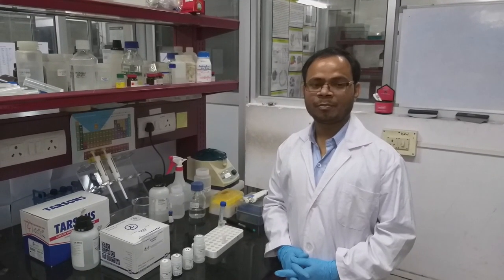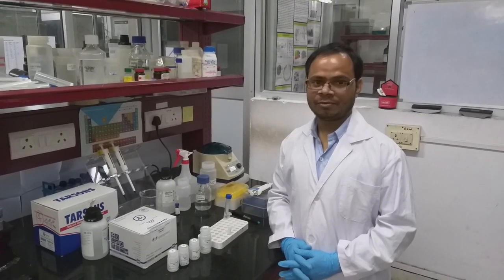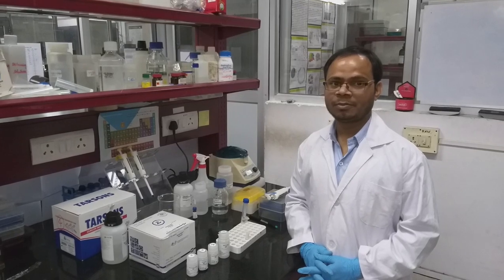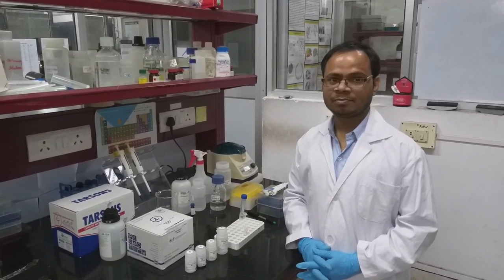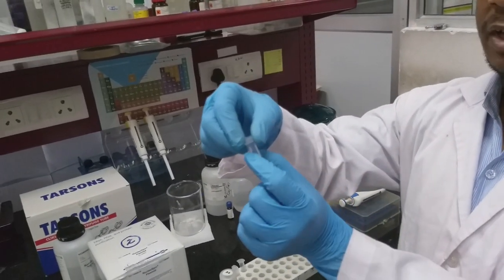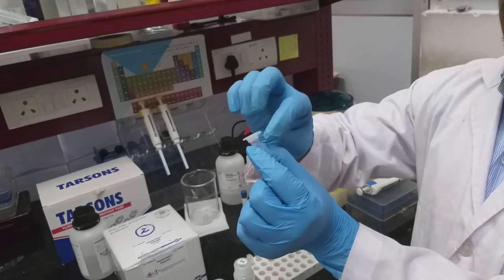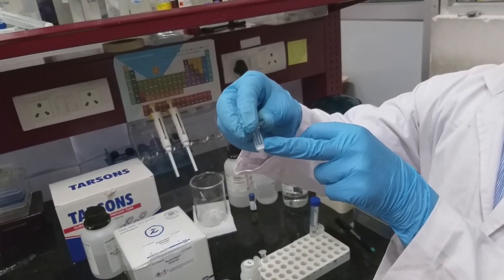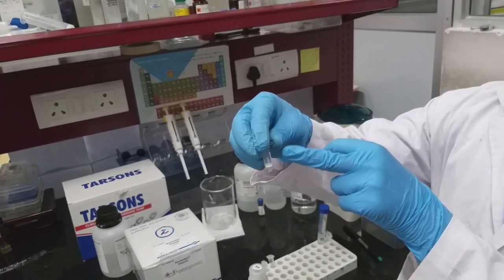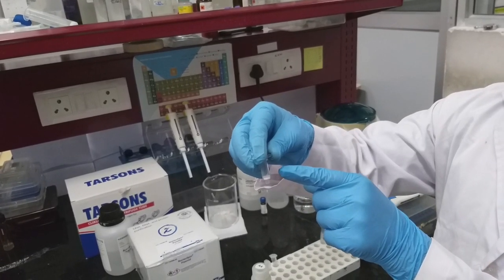To ease the process of the manual alkaline lysis method, there are several kits available from commercial vendors. The basic difference between the alkaline lysis method and the kit-based method is that the kit-based method contains silica-based columns, where the lysate containing plasmid DNA binds to these beads. After washing, the unwanted components elute out, and we will elute the plasmid DNA in TE buffer or water.